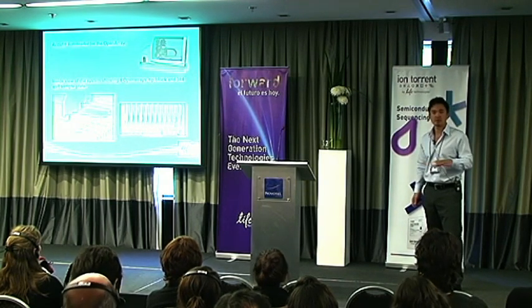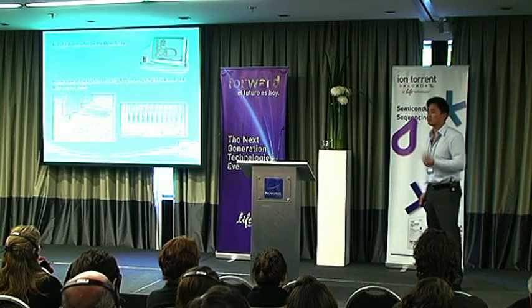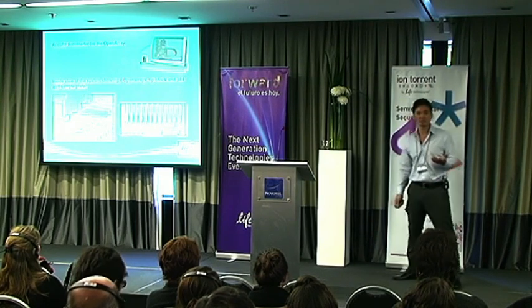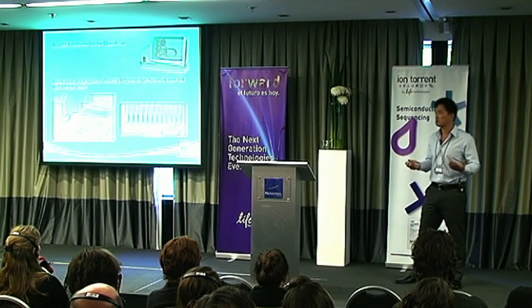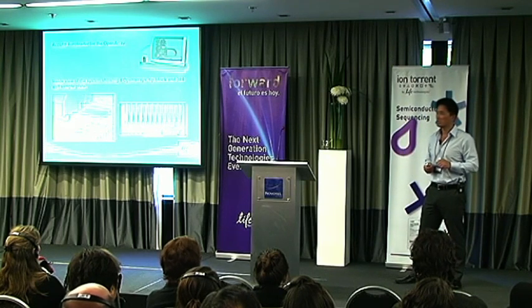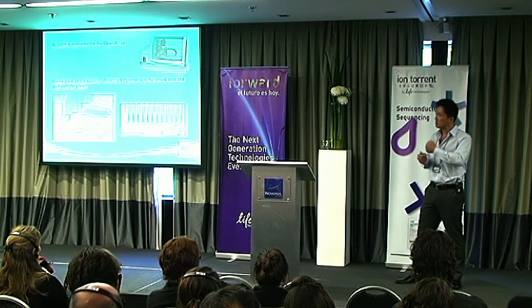Those are the different formats, right? I explained that you don't actually pipette manually the assays into the arrays. Now, what's missing from the reaction itself now? We have the assays in place. We're missing the sample, and we're missing the master mix. And we don't expect you, of course, to manually pipette that by hand into the little arrays either. As far as I know, there's no multi-channel pipettors that can allow you to pipette 3,072 wells.